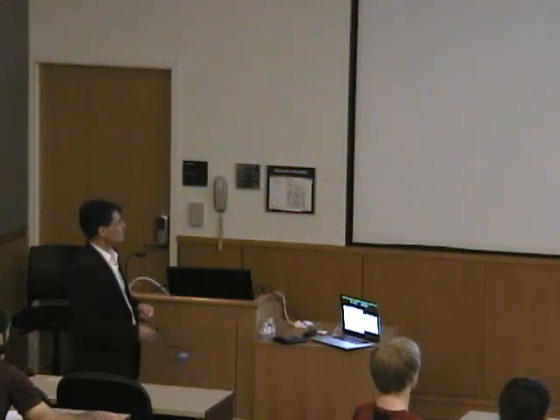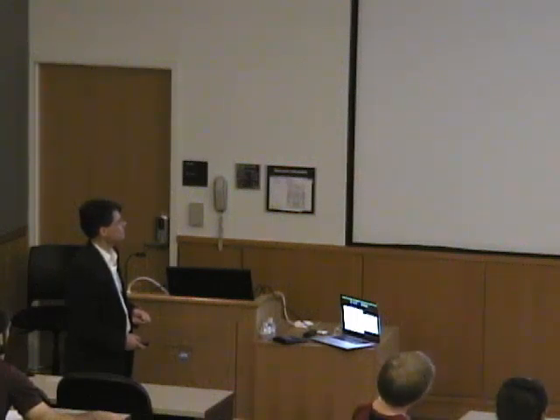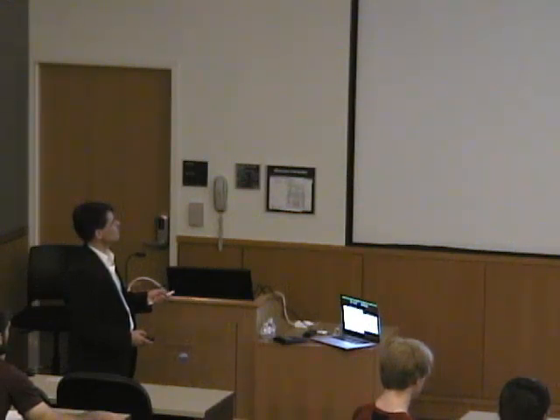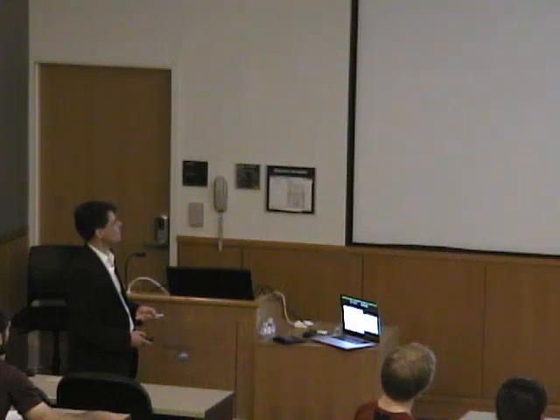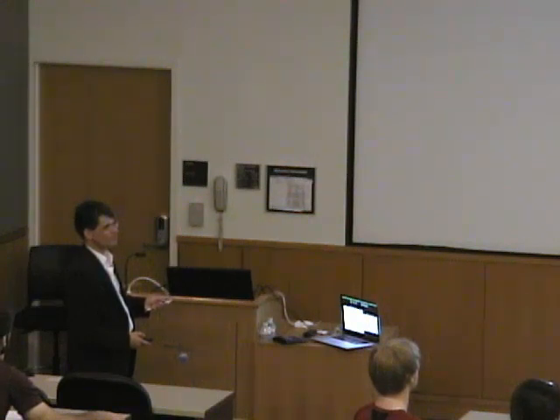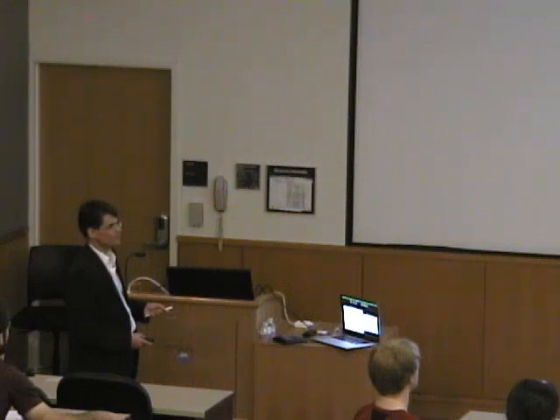Now, even if you look superficially at the MCD spectrum, for an absorption spectrum like this one, it's basically a relatively featureless blob. But if you look at the MCD, and in particular if you combine it with the natural CD spectrum, you see that there is a lot of structure. You could never have fitted 12 or 13 electronic transitions or bands under this absorption spectrum without getting punished by your advisor.